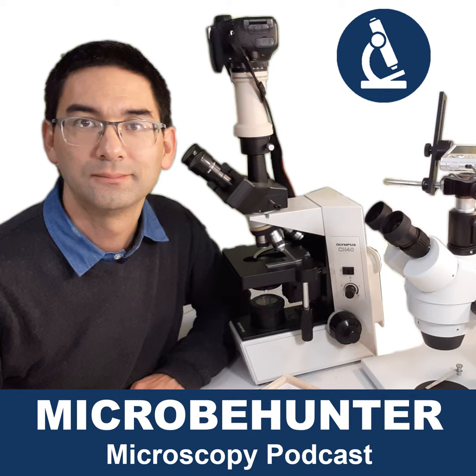Something that I also tried some years ago is the drawing of specimens. That's a little bit more the artistic side of the hobby. And still it is not outdated. I have to be very honest with you. Some people say, well, drawing, do you really have to do that nowadays? We've got all the photographs and the digital cameras that you can connect to the microscope. Is drawing really still something that is necessary? And I'm saying yes, and I probably will be also into the future.